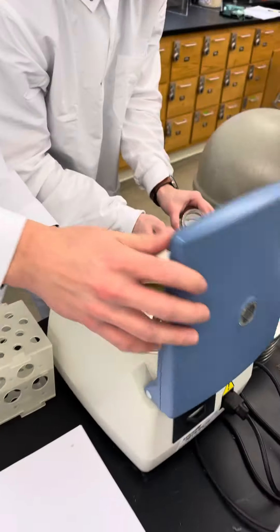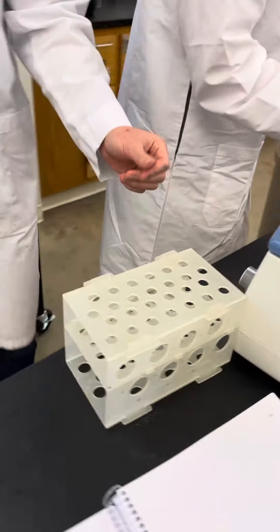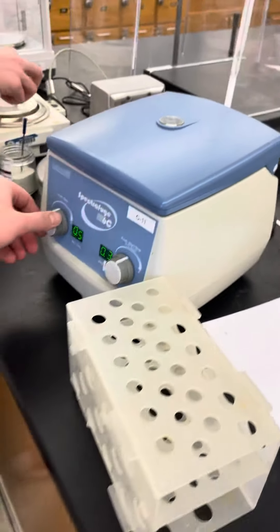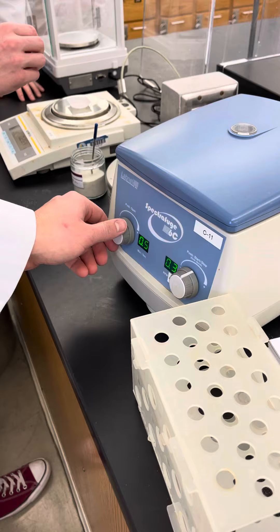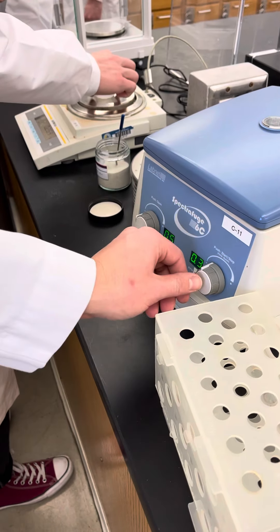If there's three, then you put it into a triangle, and you're going to close it. You're going to set the time that you want it to go for, the RPMs, and then you're just going to press start.